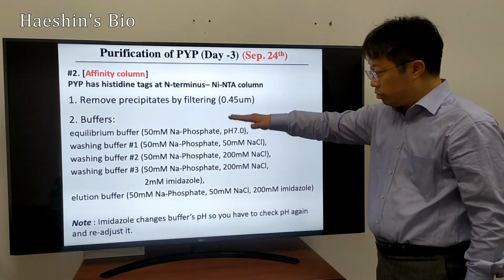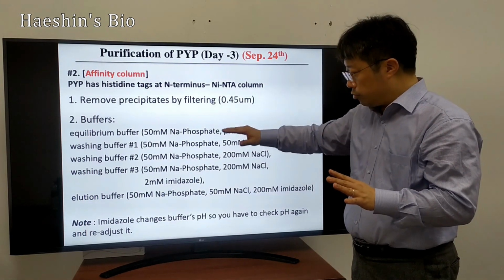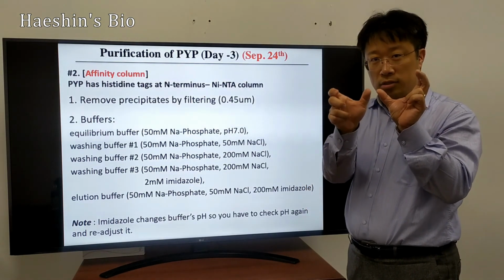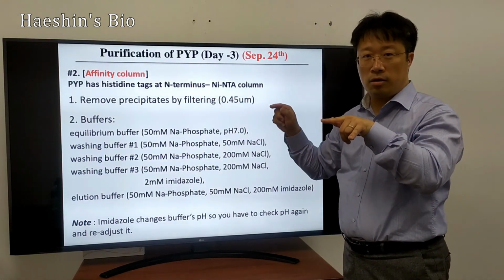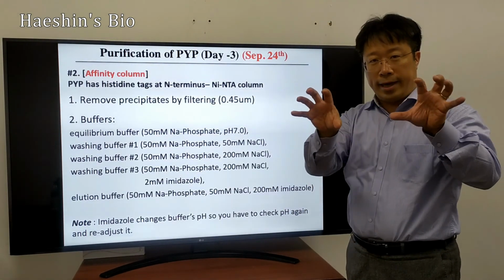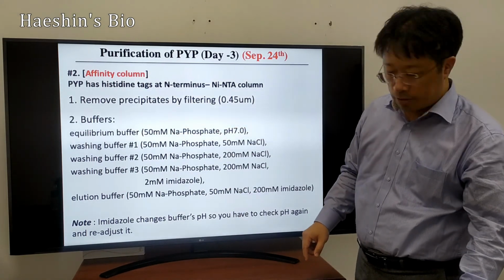That is how this whole procedure works, with protein adsorbed on the nickel histidine column. Basically you add these solutions, you wash everything away, except for the PYP that actually has the histidine tag. That tag is bound to this histidine tag column, the NTA column. And now you add this concentration of imidazole, and then this tag is now eluted basically at this elution buffer. That's why you have to prepare several buffers there.